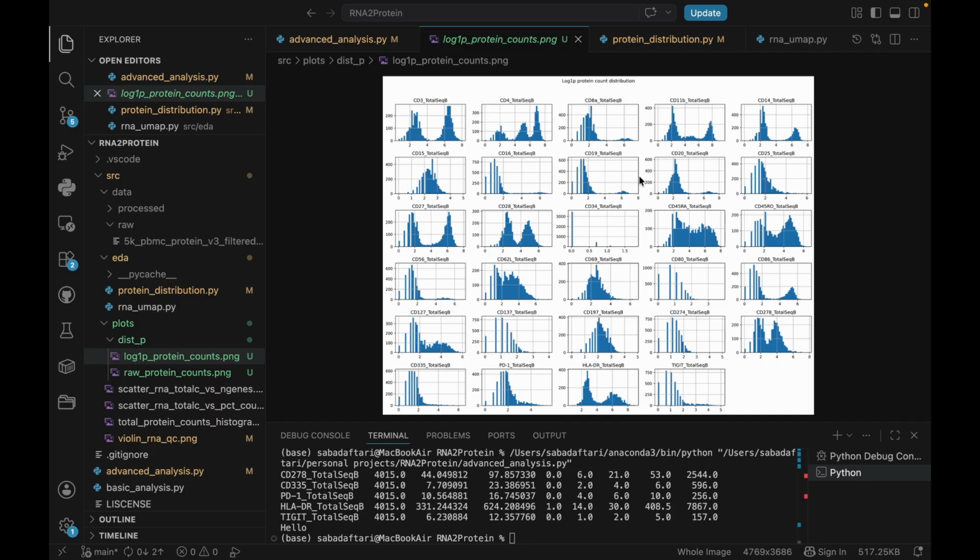Now, when we look at the logged version of the data, we kind of see that there are little bumps here. So this guy has 2, this has 3, and then there are some of them that have technically nothing. Interesting. So these 2 humps are called bimodal distributions.